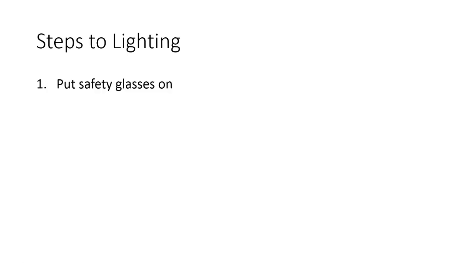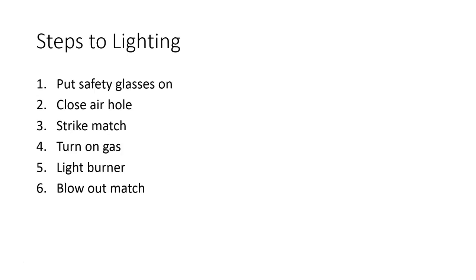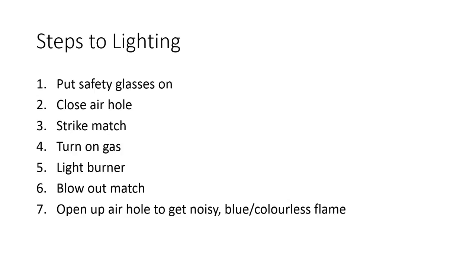Steps to lighting — it's actually pretty simple, like lighting a tiny barbecue. Put your safety glasses on, close the air hole, strike a match, then turn on the gas, then light the burner, then blow out the match. That's when you open the air hole.